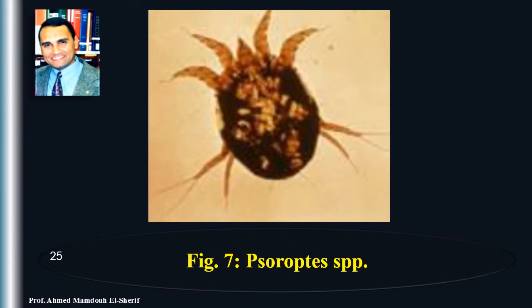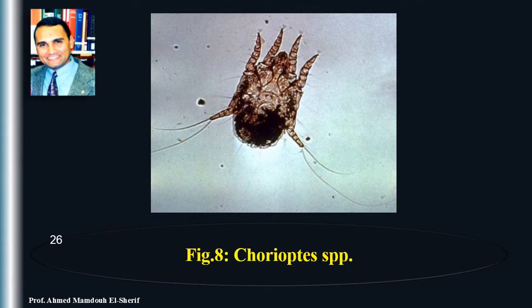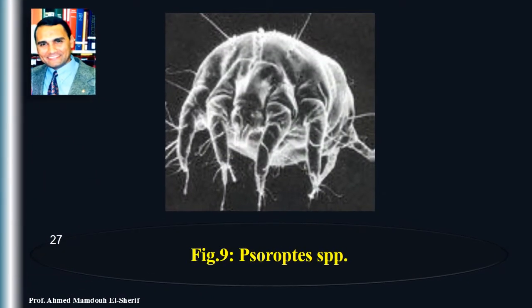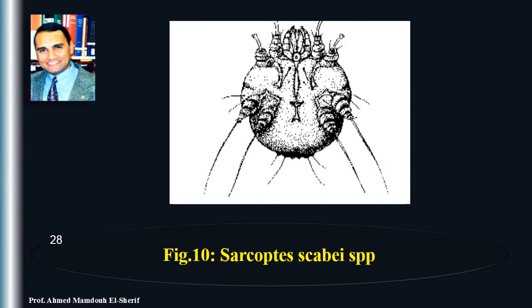This is the figure of Psoroptes species of mange. A figure of Chorioptes species. A figure of Psoroptes species. A figure of Sarcoptes scabiei species.